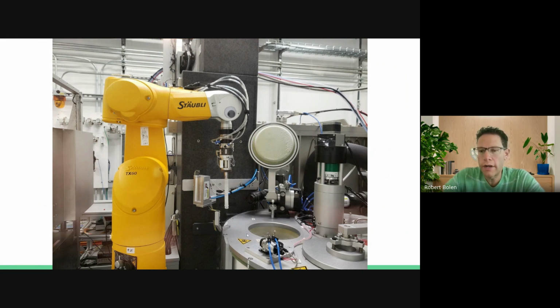And the pucks are stored in this giant liquid nitrogen dewar. And the dewar is just a big storage container. It's like a giant freezer that keeps the pucks in there. And so the end of this gripper will grab one of the pins, and then it will precisely place it into the beam so that we can then analyze the protein structure.